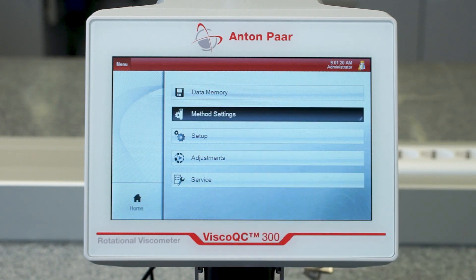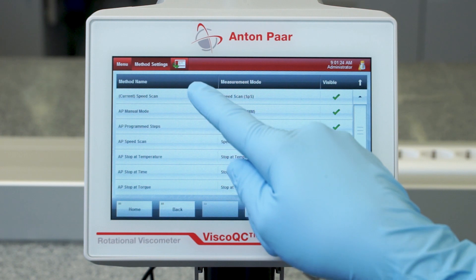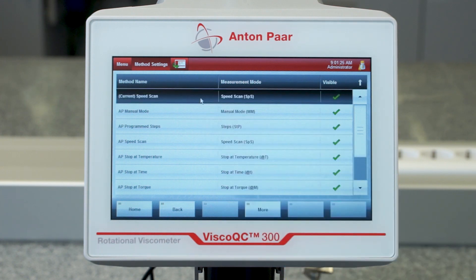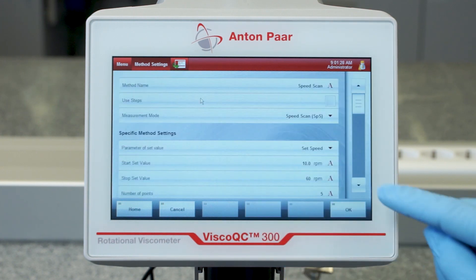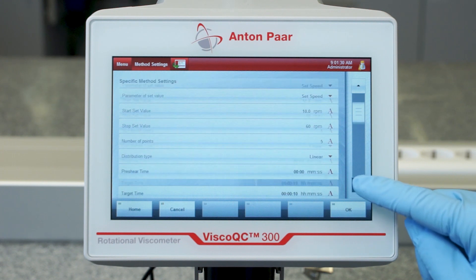All Anton Paar default methods are automatically updated with the online graph to see live measurement data. Customized methods must be updated manually.